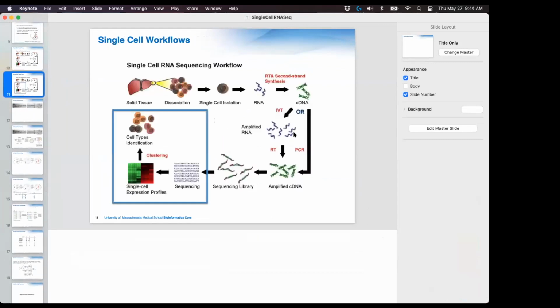So I'm going to go to this slide. You started with your cDNA, where each transcript in the cell was captured by the oligo and made into a single cDNA. Then we went through these IVT or PCR steps where we're amplifying this library many times. If we started with 1 nanogram of material, after all of this amplification let's say we have a microgram of material, an increase of 1,000-fold.